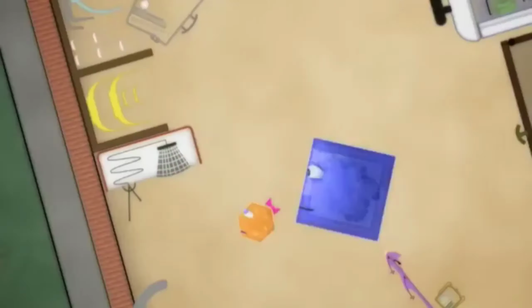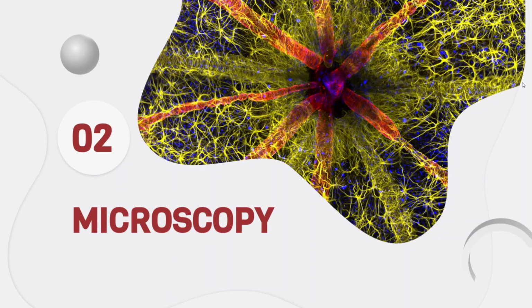So, like the square, scientists break through dimensional barriers to uncover hidden layers of reality. I hope this introduction has made you curious about using microscopy to obtain 3D images. Now I'll start with a brief overview on microscopy and microscope components, to finally tell you more about 2 types of 3D microscopy techniques, and explain better the one that we use in my research laboratory.